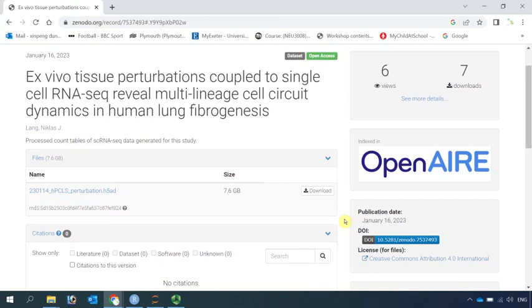Hi everyone, welcome to my Seurat Scampi video tutorial. Today I'm going to show you how to convert H5AD files into a Seurat object.